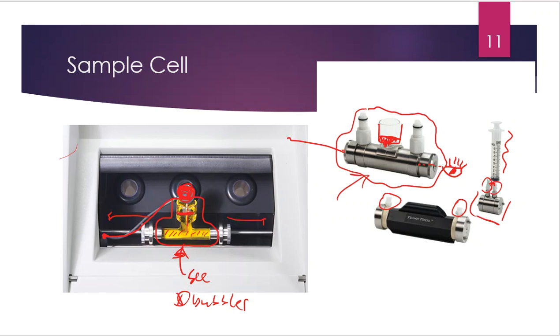And then you're going to insert sample until you start to see a little drip, drip, drip out the other side. And you're going to wipe that off because you don't want contamination there. You want to wipe all of that dripping off because that can be a problem if you leave it behind and everything gets sticky and becomes a mess. And then we're going to start screaming and yelling and complaining with you.